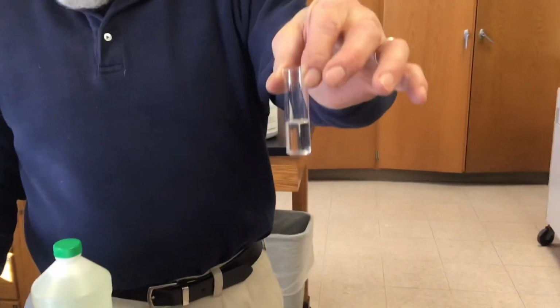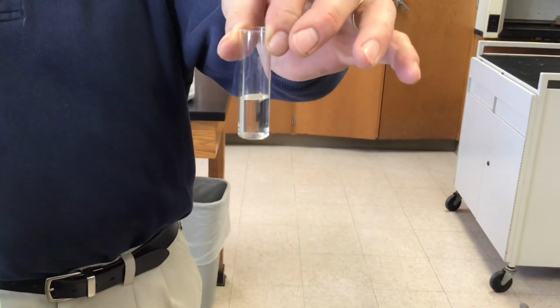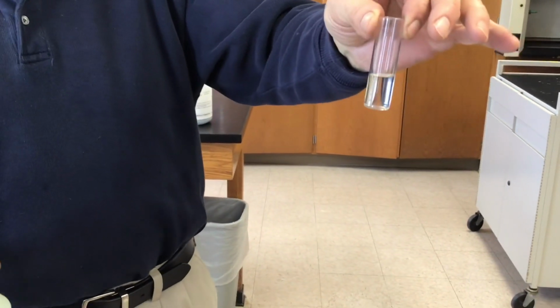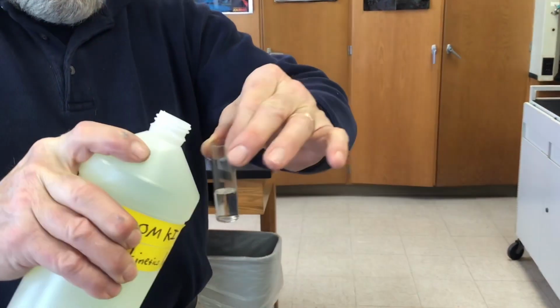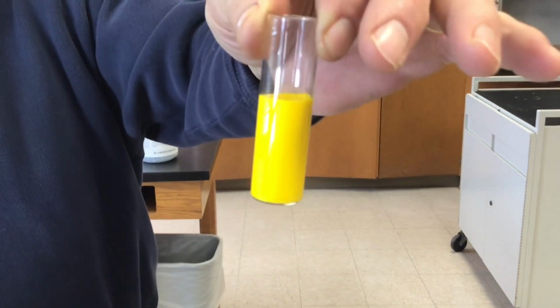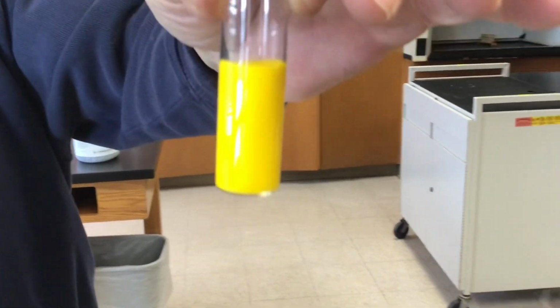Okay, so there's the lead(II) nitrate. There's that ionic compound dissolved in the water. It looks just like water. The ions separate from each other. Now we're going to add a little potassium iodide, KI, to it. Two aqueous ionic compounds. What type of reaction is going to happen? Whoa. And that was fast. Isn't that a beautiful yellow? That's a fabulous yellow.